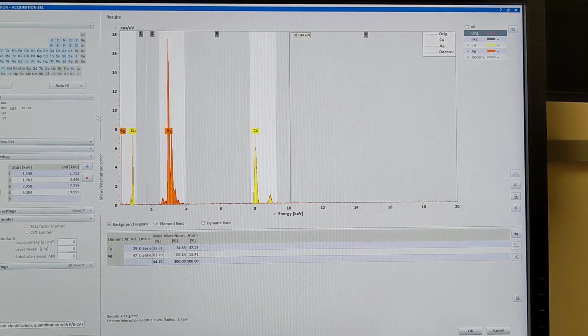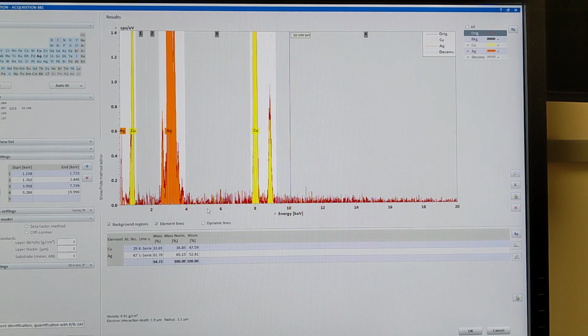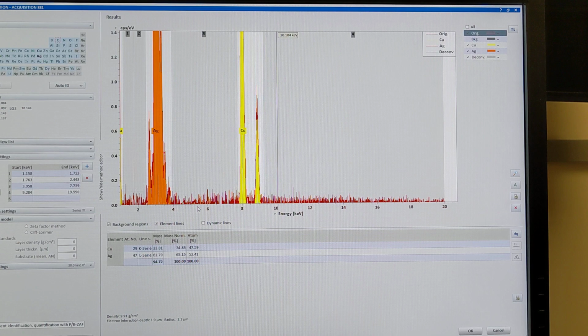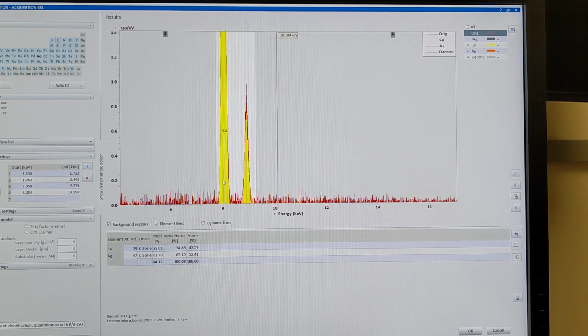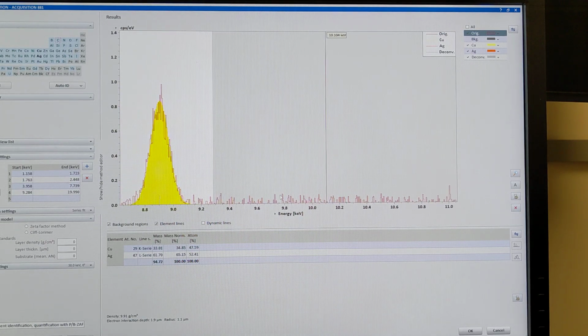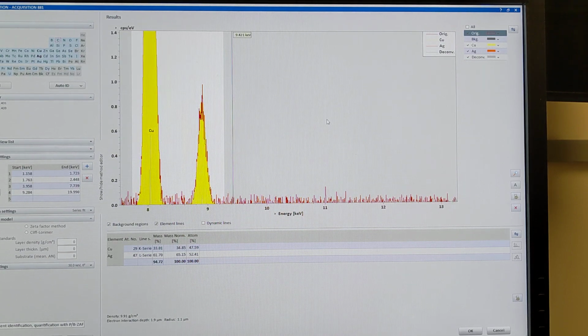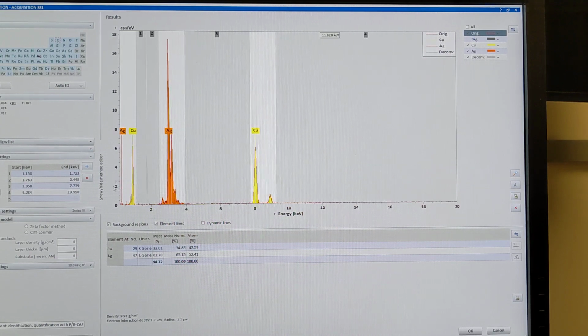If you look at the plot, you can left click and drag and change the scale, right? You can drag around here. If you scroll the mouse wheel while on the plot, you can expand along the center point, wherever you left click. Or if you want, the button here on the right, the little a, is your scale, so you can return it back to what you want.